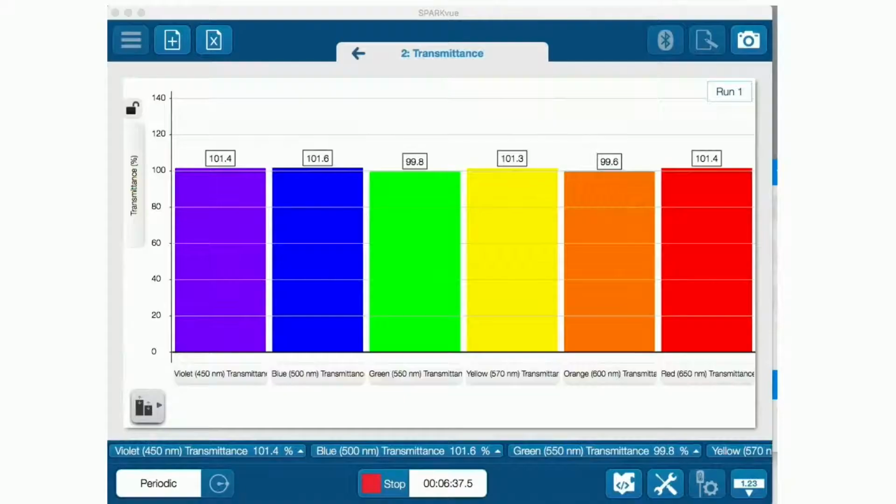And so I can do that experiment. It's great with the spectrometer, but we're really only looking at two very specific wavelengths. We're looking at a very specific blue and a very specific red, so I can do that also with my colorimeter. We can have fun with colorimetry. So let me open up my colorimeter here. I've already got it paired up. You can see that my colorimeter has 100% of everything showing. It gives 1, 2, 3, 4, 5, 6 different specific wavelengths.